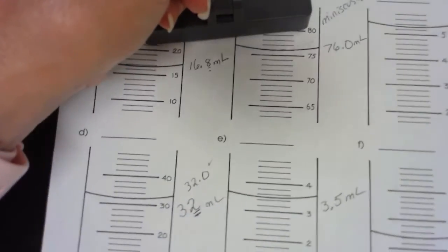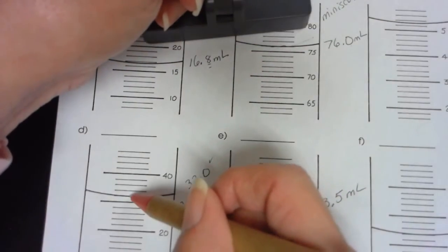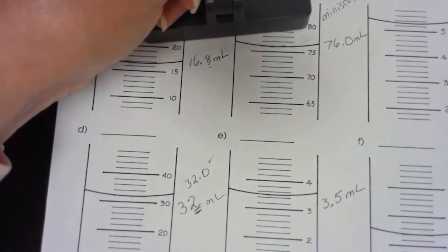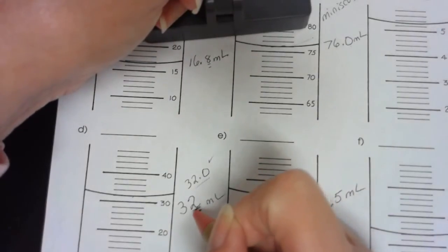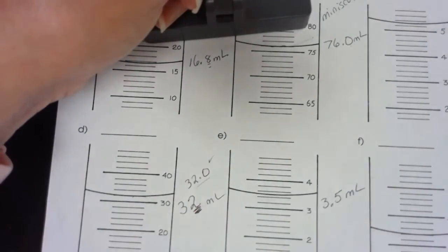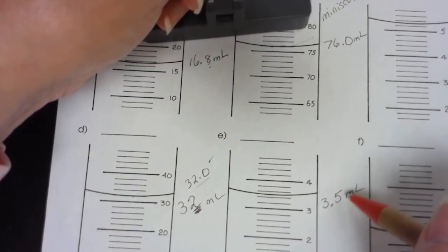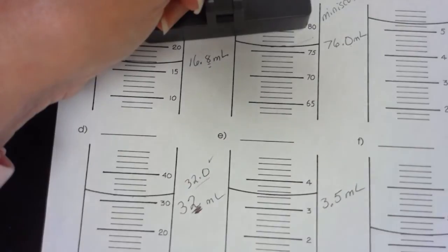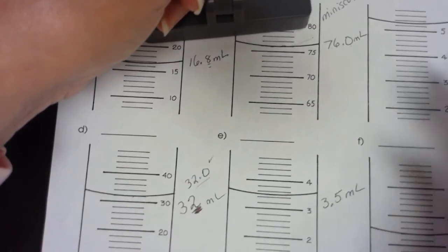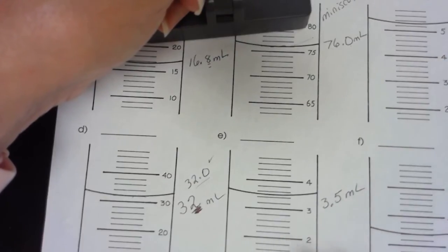Whereas since it landed right on the dot right here, the correct answer, I guess, would have been a 0.0. But what I'm expecting from you, I can understand how you would keep it at 32. Okay, and so I'm comfortable in this case with that because according to the procedures that we've done these other times, that is using that same procedure.